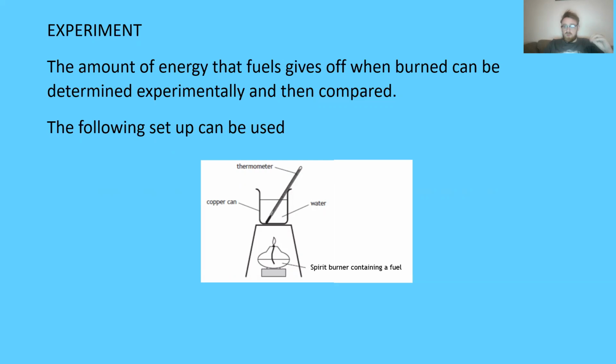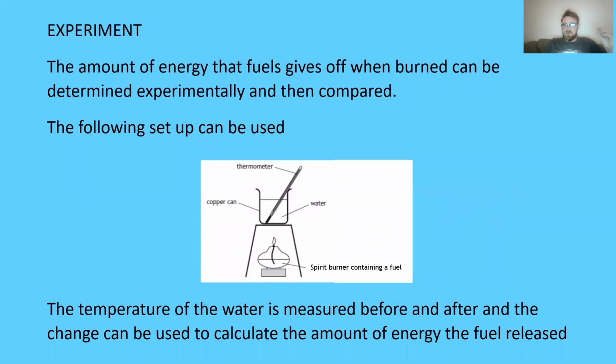So you've got your spirit burner with the fuel, your tripod, copper can, thermometer, and water. The temperature of the water is measured before and after, and the change can be used to calculate the amount of energy the fuel released. Pause the video, take that note, and then unpause, and we will move on.